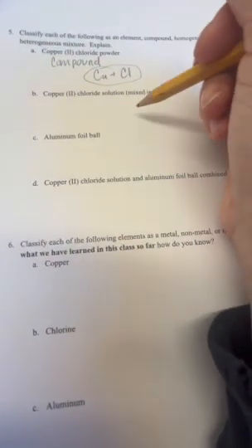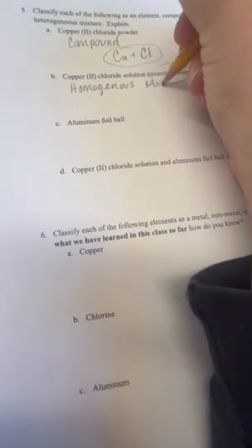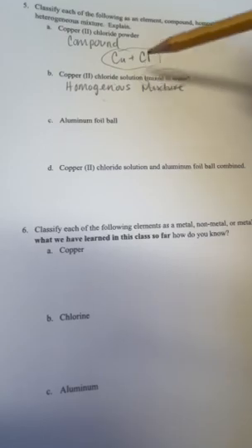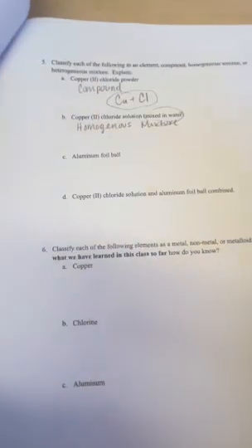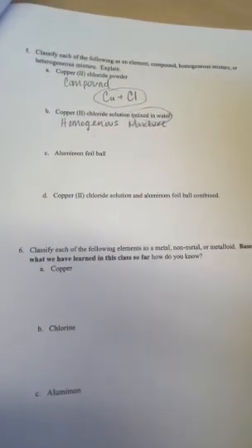And the second one, copper chloride solution. So we're mixing it in water. We're going to call it a homogeneous mixture. That's because this copper chloride has dissolved into this water. It's created a solution, and a solution is interchangeable with a homogeneous mixture.